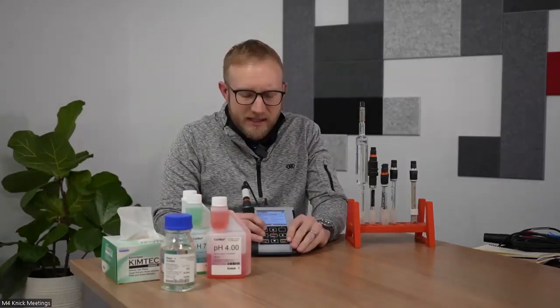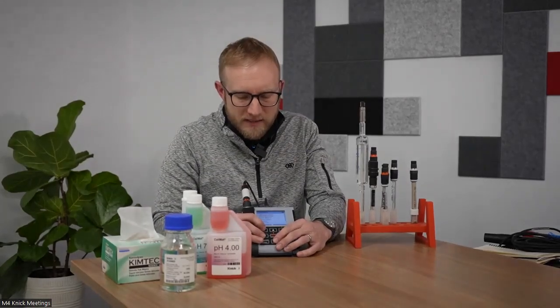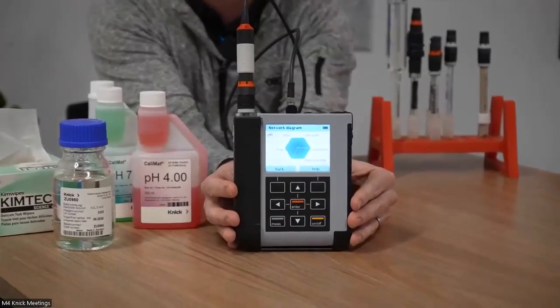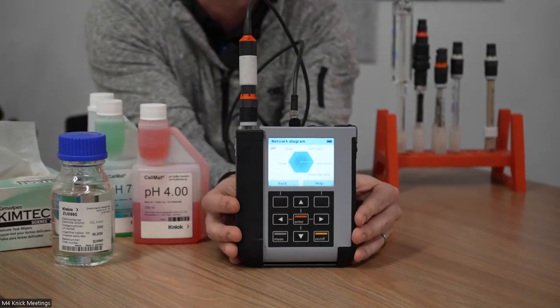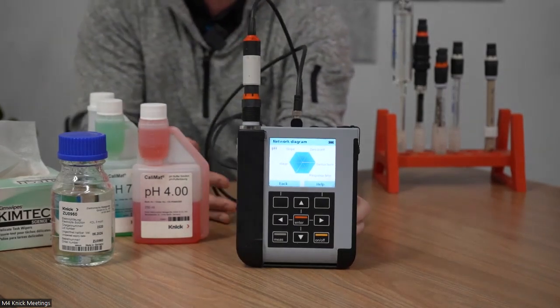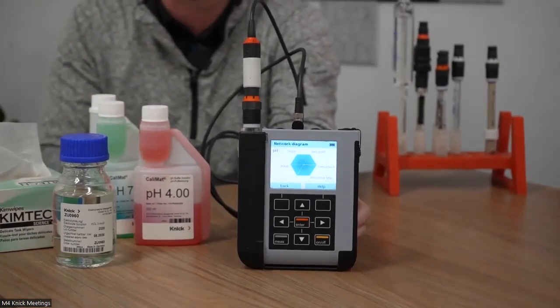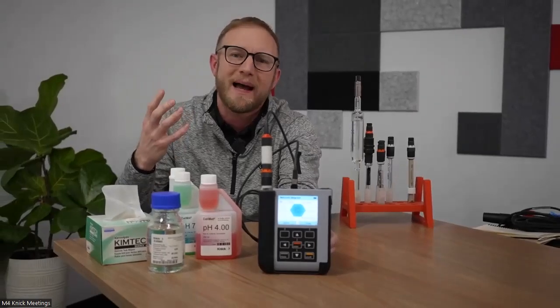Here what you see is the key parameters of a glass pH electrode that we're continuously monitoring with a MemoSense digital sensor. These are things like slope, 0 point, glass impedance, response time, and sensor wear. Those are all things that with analog technology, you need to pay attention to the specific voltages and specific impedance values to understand, are you getting maximum accuracy out of your pH electrode?